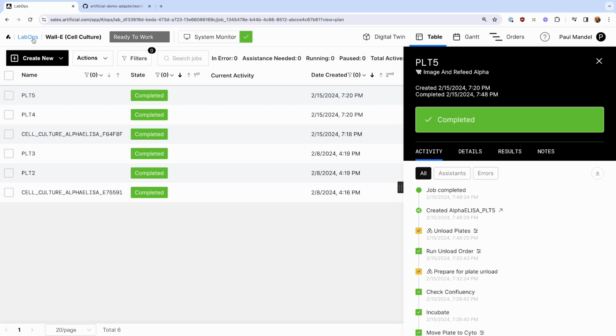We're gathering just-in-time data from the operators, results from the experiments we're running, consolidating that with the scientific parameters and some contextual metadata, and storing that in an indelible data record in the cloud. You can access that data record from our app from anywhere in the world, or we also have a RESTful API that you can use to programmatically get it and do whatever you want with it.